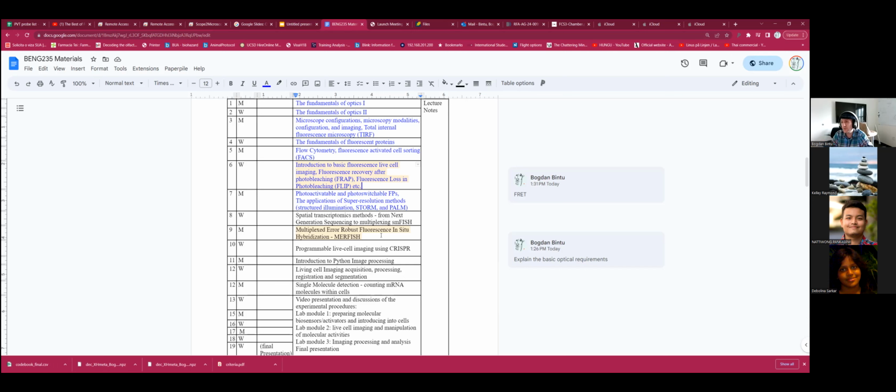Or what I specialize in even more is labeling DNA pieces and seeing if, for example, different enhancer elements interact with certain genes and whether that promotes transcription or not. All of these are the fundamental technologies to be able to take a cell and image all these different components, all in different colors. And then the whole question is how to do these many, many colors. And perhaps a question somewhat relevant to this course is, can you do that in live cells, and how much can you push some of the concepts that we've very recently learned towards the live cell? That's the core of it.